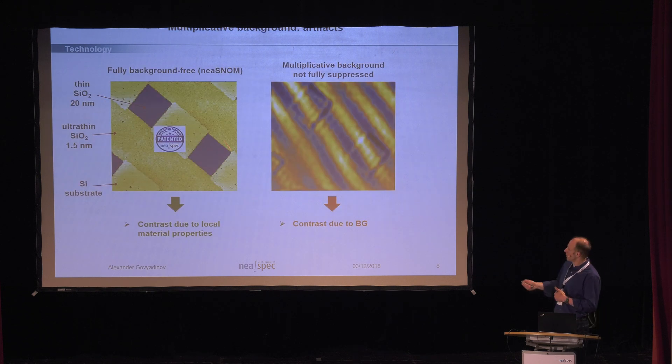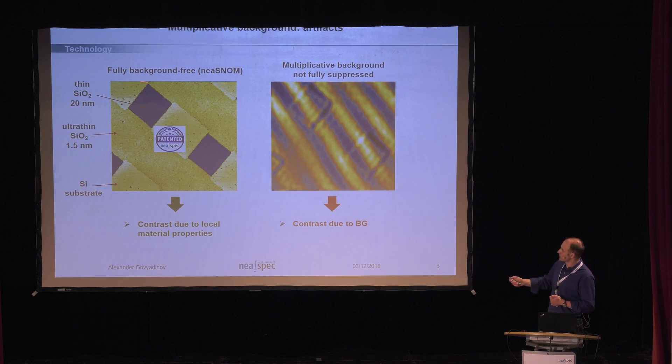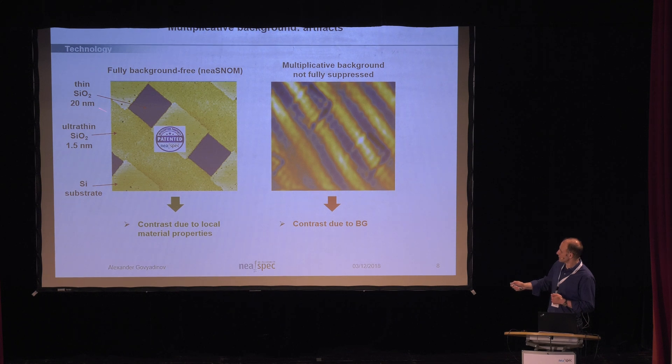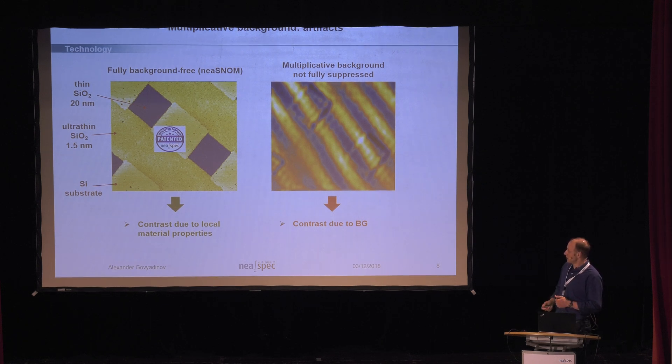Maybe it's not important. Let's see. So this is one of the examples. On a test sample, which is essentially a periodic array of squares made of silicon dioxide. This is the silicon dioxide square. This is the silicon substrate. The point here is that you can clearly see these squares of silicon dioxide. You can check the resolution if you do the line scan across. So this is what you will get if you fully suppress the background and this is how the image should look like. Now, if you don't suppress the multiplicative background, this is what you might see. So this image doesn't show you the local properties of the material. It just shows you some interference artifacts.